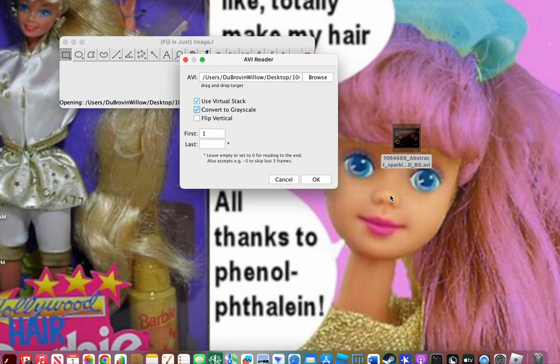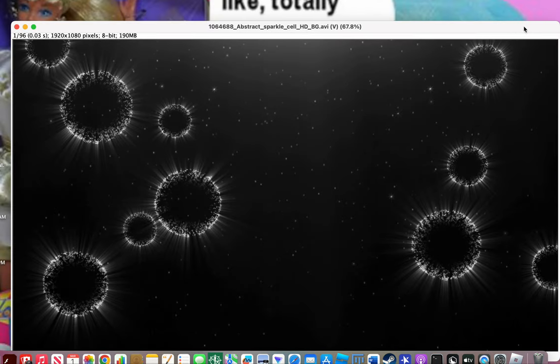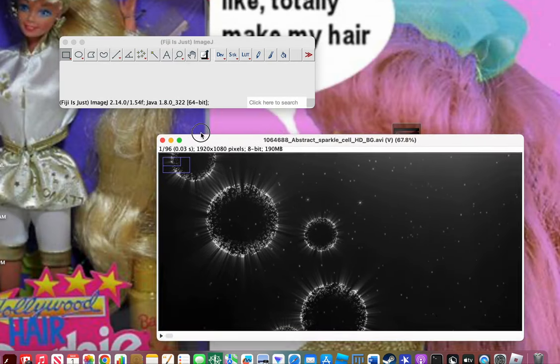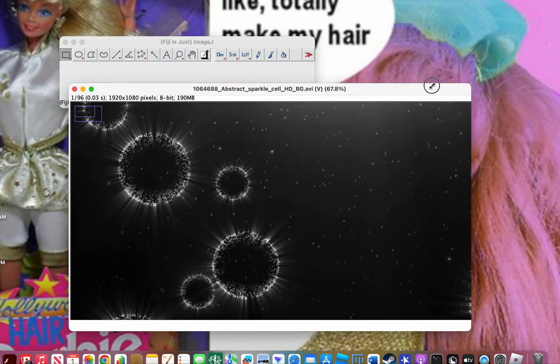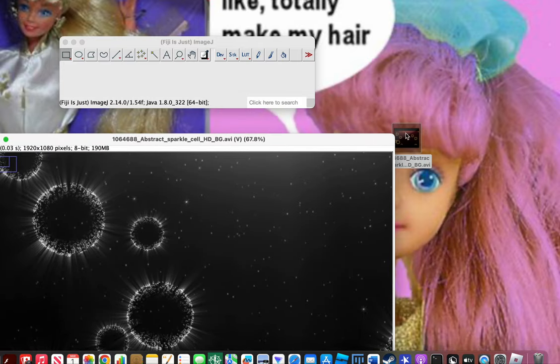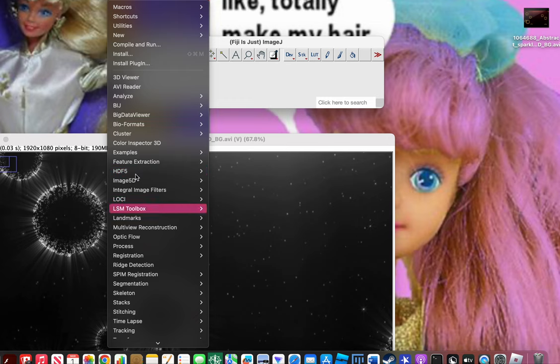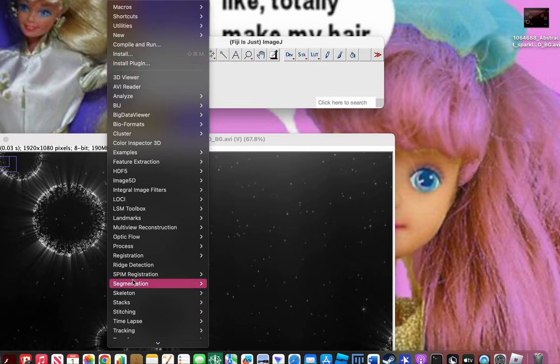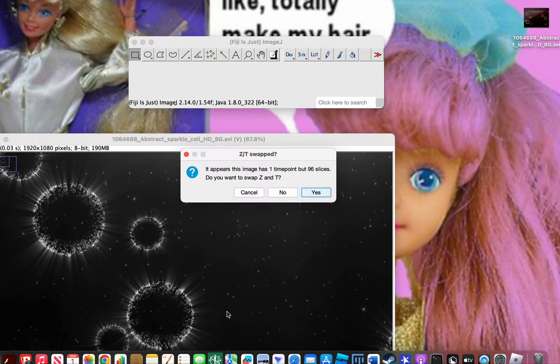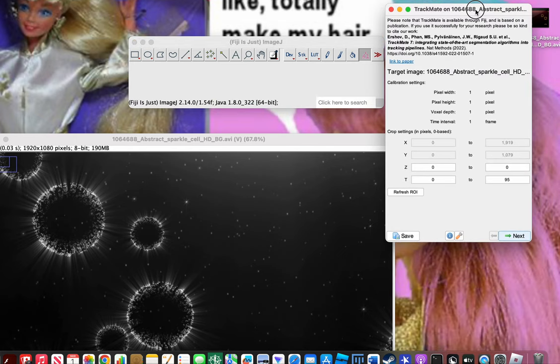There are about 24 frames per second, so if you want four seconds do about 96 frames, or 48 for two seconds — whatever you need. Press OK and the grayscale video pops up. Then click Plugins at the top of your screen, click Tracking, then click TrackMate. It will ask if you want to swap Z and T — say yes. I don't know exactly what that does but it is important, so make sure you do that.